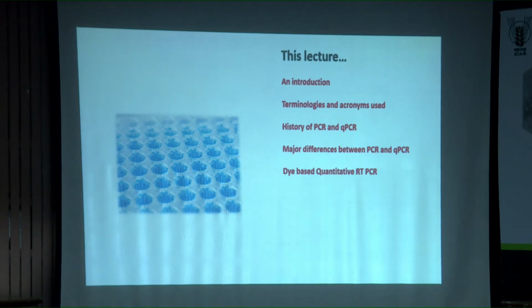So right now we have two different techniques. One is the dye-based quantitative real-time PCR, and another one is probe-based quantitative real-time PCR. I would say dye-based qPCR and probe-based qPCR. Let us have very detailed discussions on that. You are supposed to know how this technology works, because the core of qPCR is centering on these two technologies, which monitor the polymerase chain reaction which is going on in the tiny tubes.